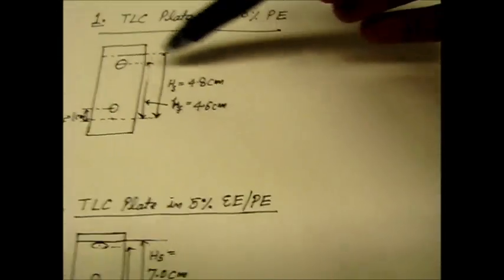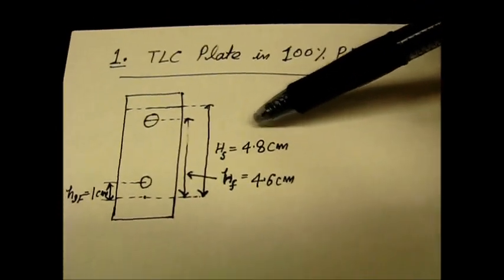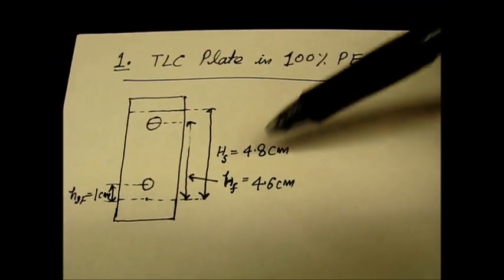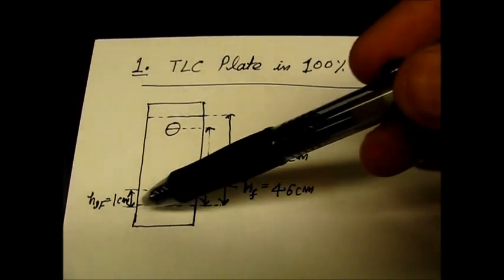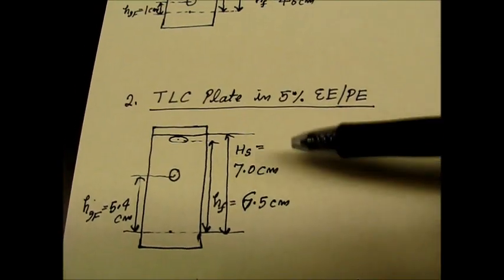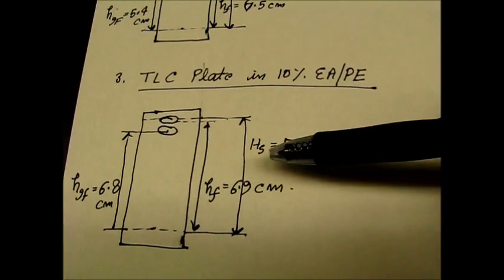Now we'll measure the height of each spot and then calculate the RF. Here we have analyzed all these TLC: TLC number one, TLC number two, TLC number three. You can see the yellow spot on each, and the nonpolar spot is very high. We have measured the height of the solvent, which is in number one TLC plate, 4.8 centimeters. And then the yellow spot is one centimeter. The blue spot is on the 4.6 centimeter. Similarly, we have measured all the heights for TLC number two and TLC number three.